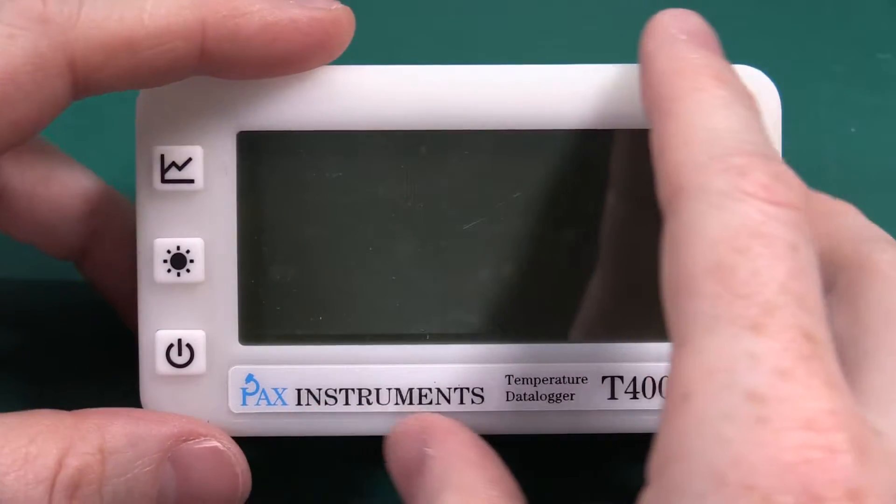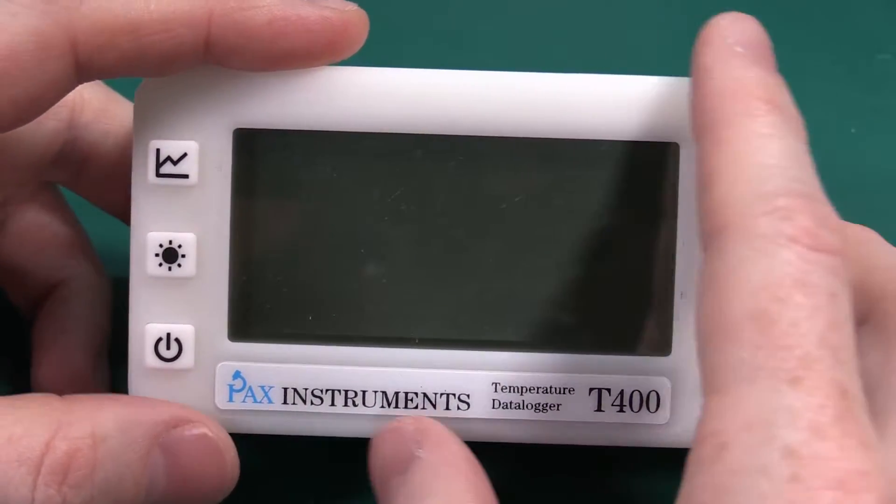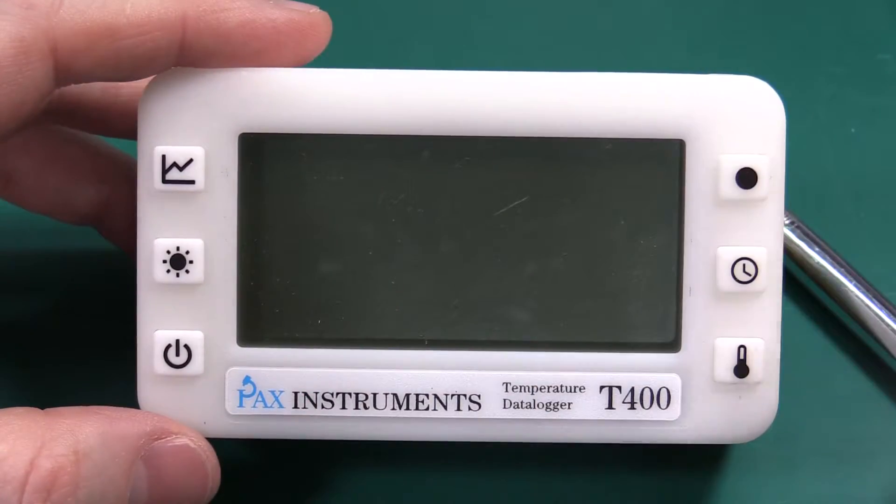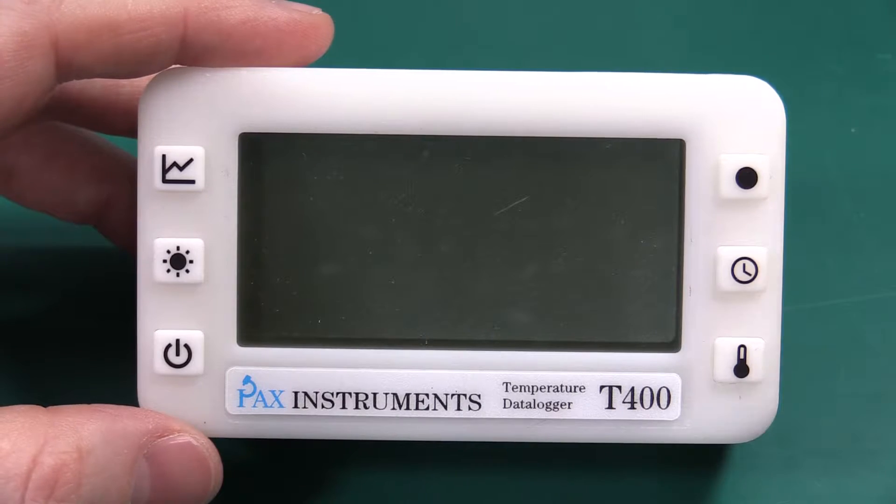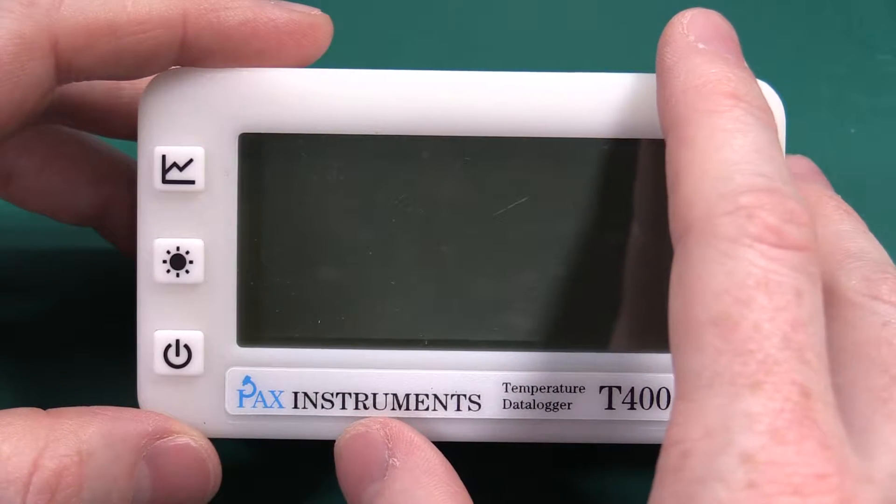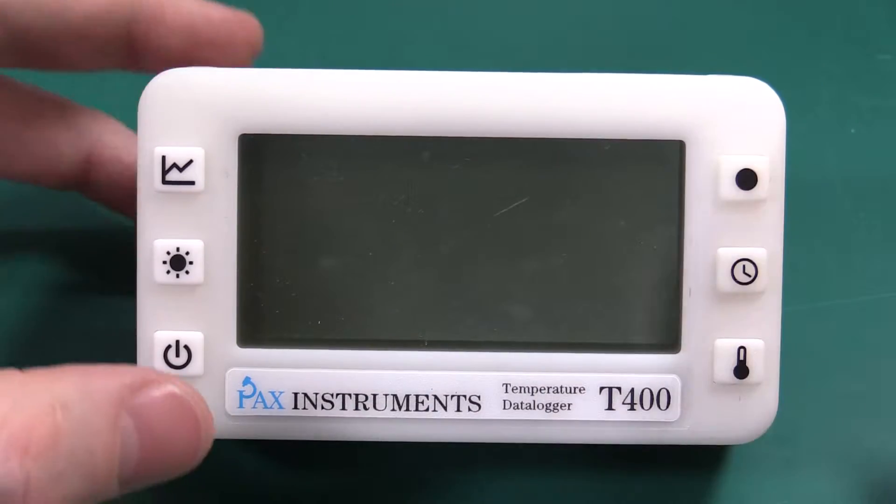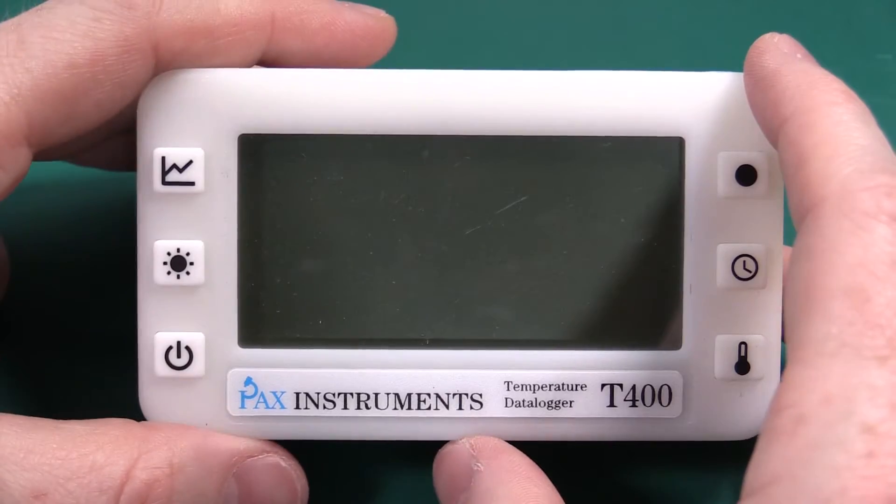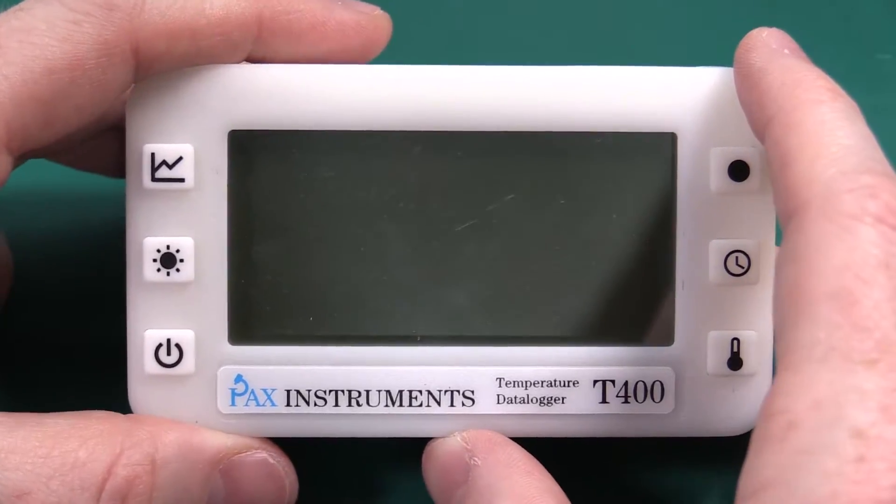So this is an SLA print which is why it's white. In the future we'll have I think a blue enclosure. I'm still not certain about what I'm going to go with but I think blue is going to be pretty good.